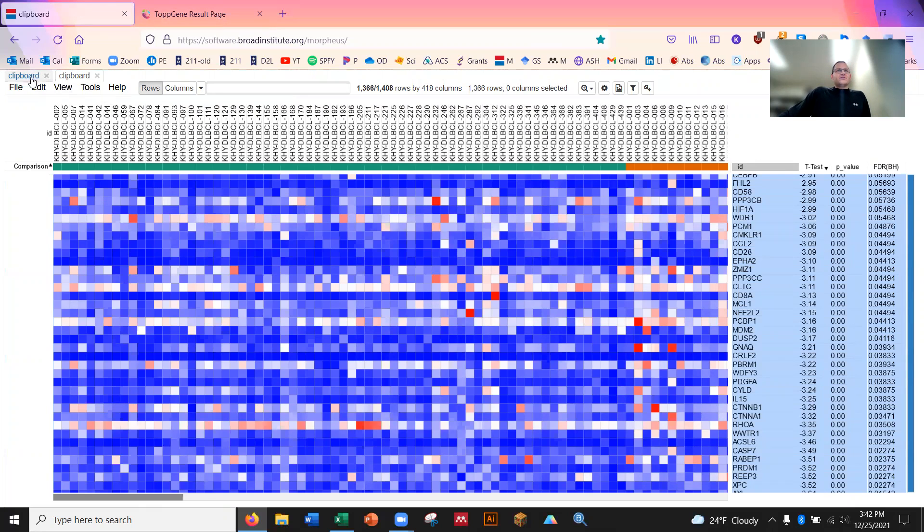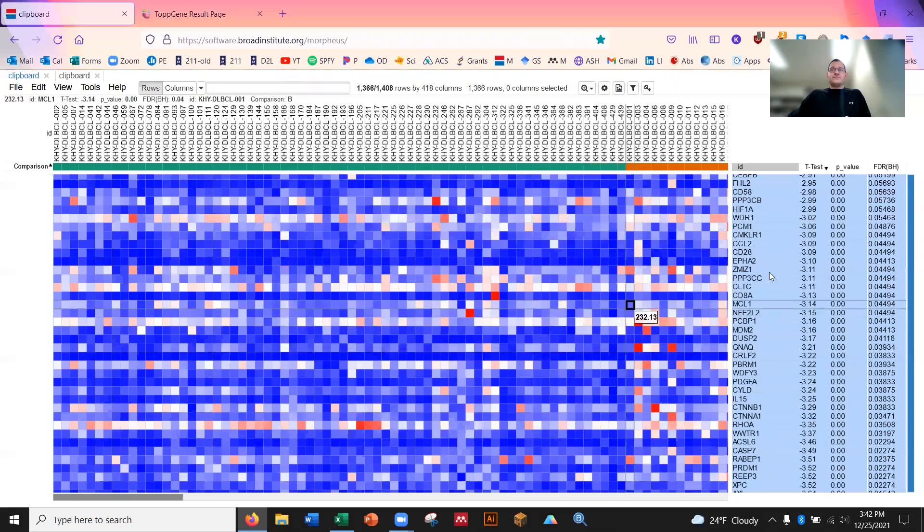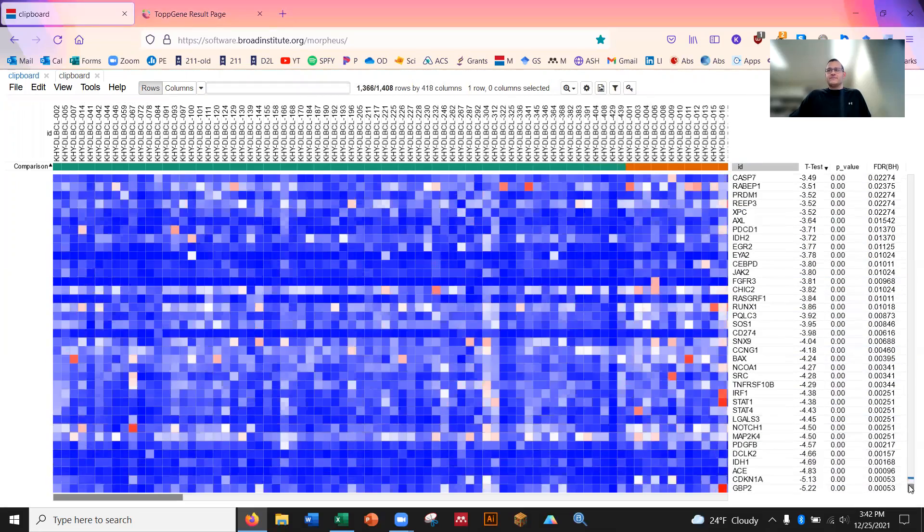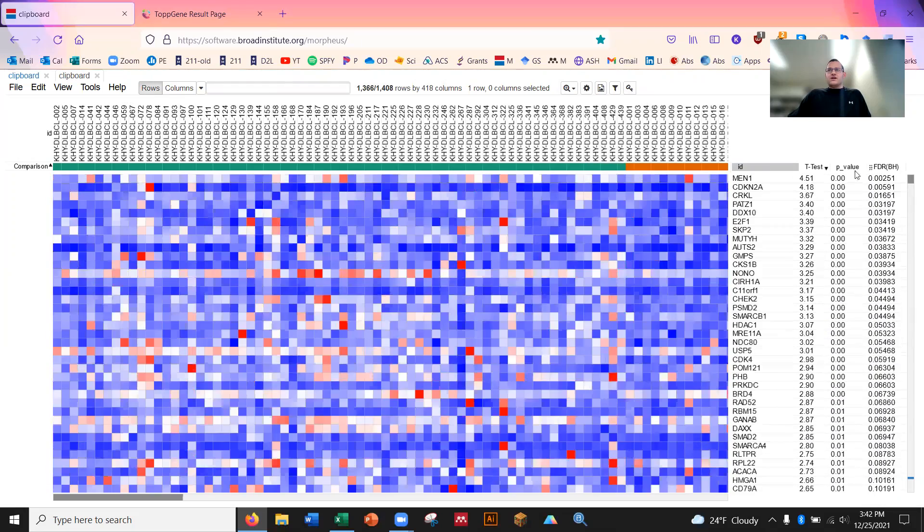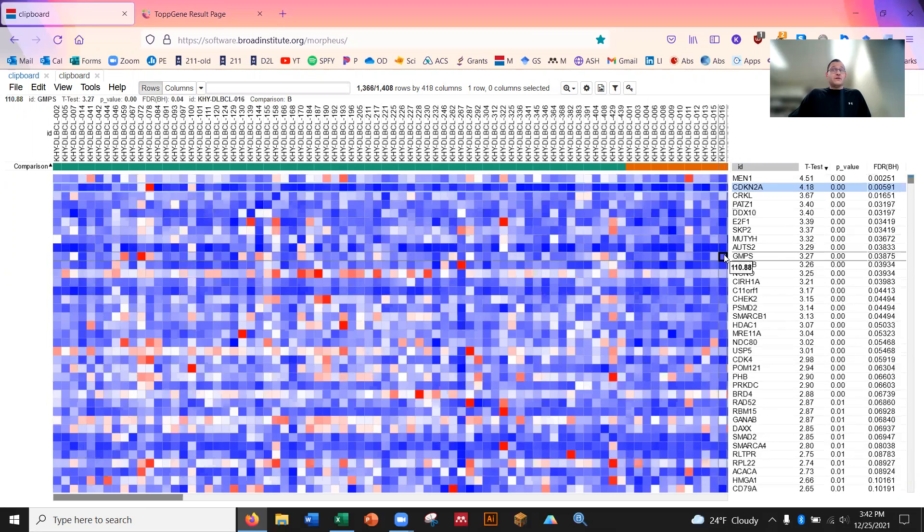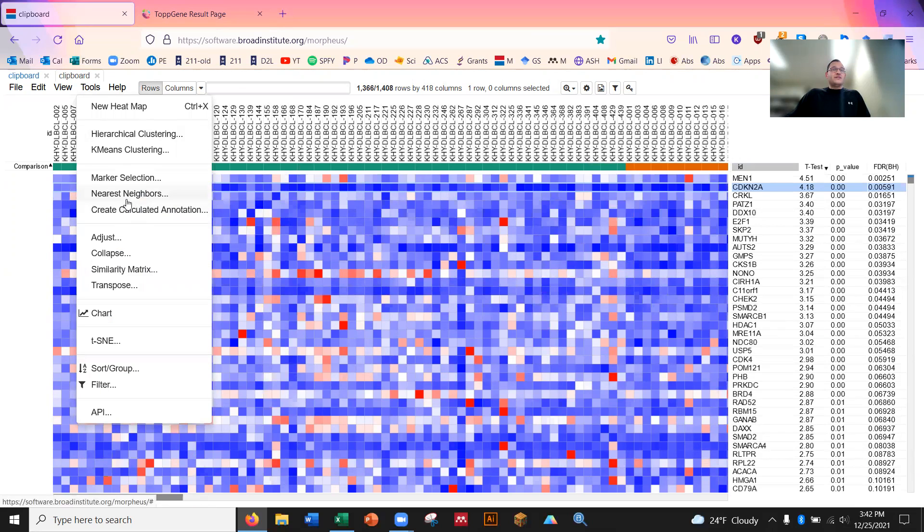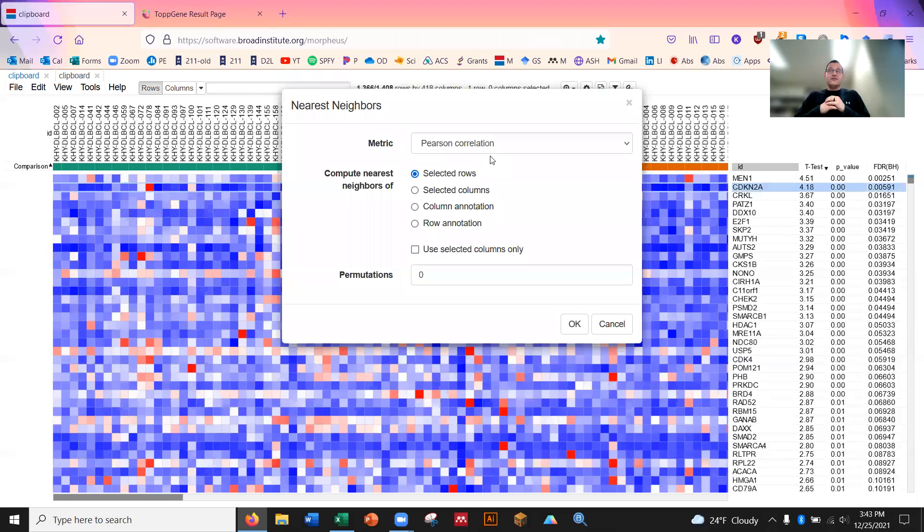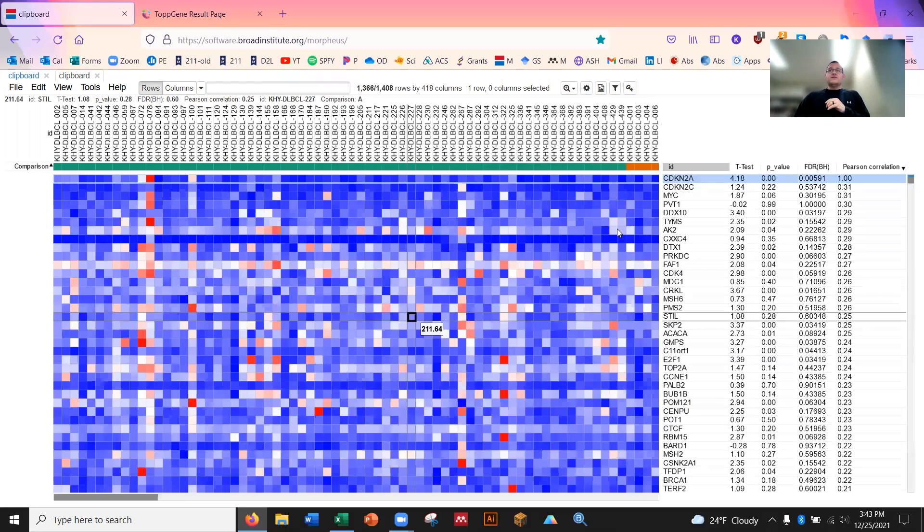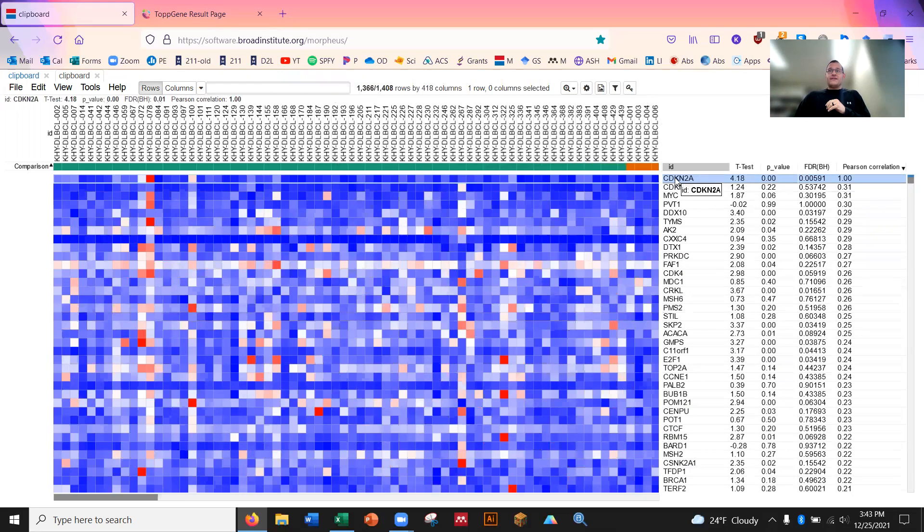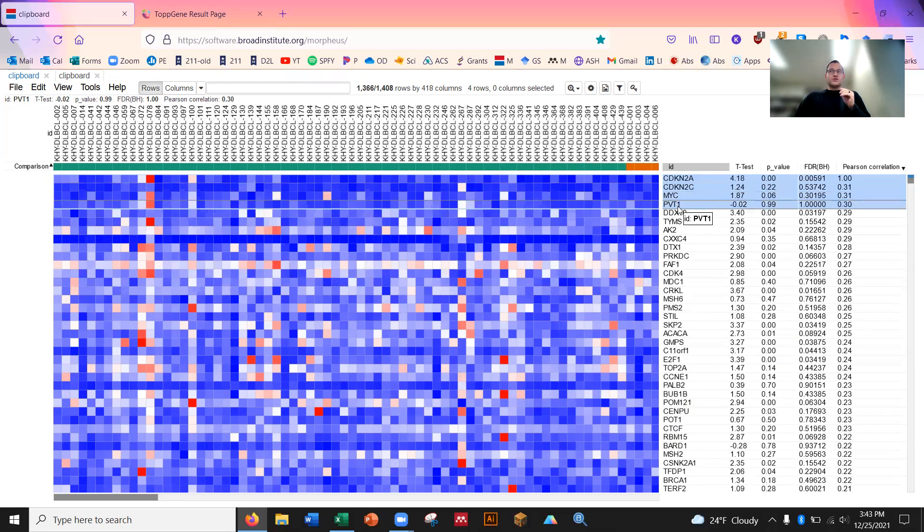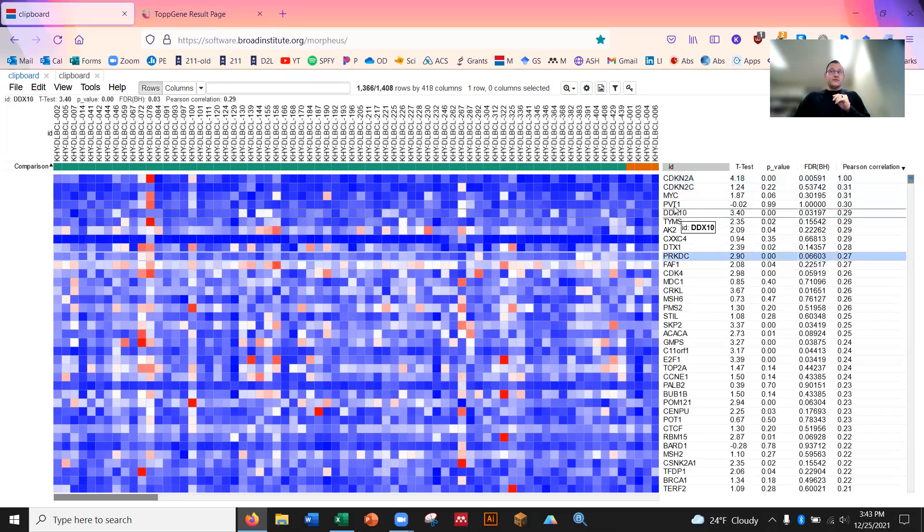So if I go back over here, actually, I want to do this. Another really good tool that you can use in Morpheus is something called nearest neighbors. So I'm actually going to find something maybe a little different. So among all these genes, I personally know CDKN2A is a very big time tumor suppressor as well. It's actually high when P53 is lost. That's actually kind of cool, right? Something kind of comes up and tries to help when you lose another tumor suppressor. So I'm going to say nearest neighbor, and I want just the selected row. What a nearest neighbor is going to say is what genes are high when CDKN2A is high, what genes are low when it's low. So this Pearson correlation that I have for CDKN2A, see what we're matching up with. Here's all the genes that have a very close association. When they're up or when they're down, CDKN2A is up or respectively down. So this is actually a pretty cool list.